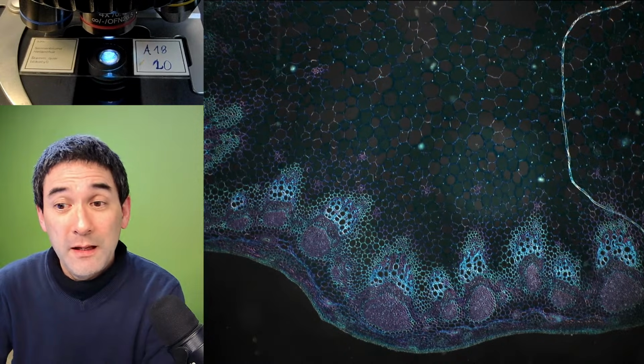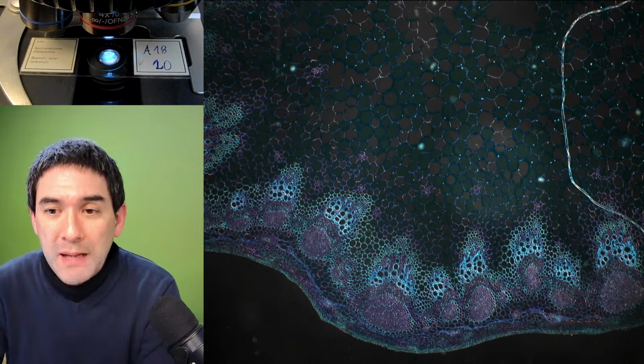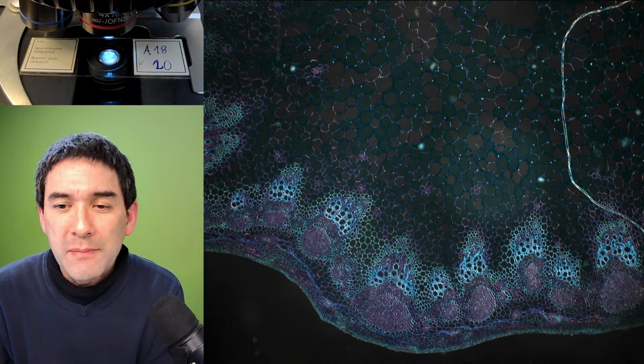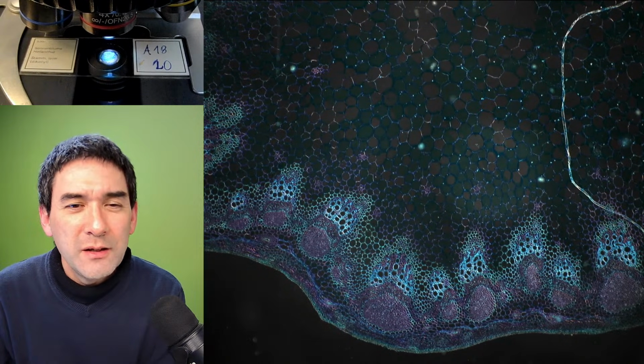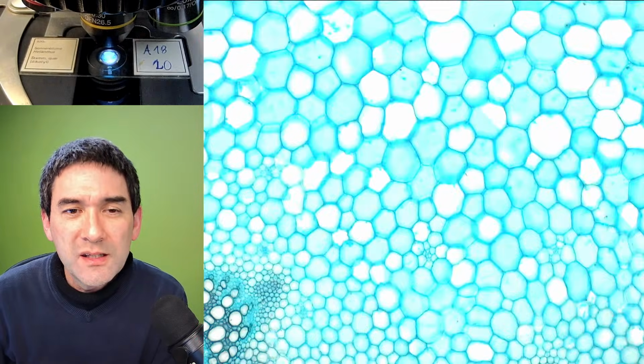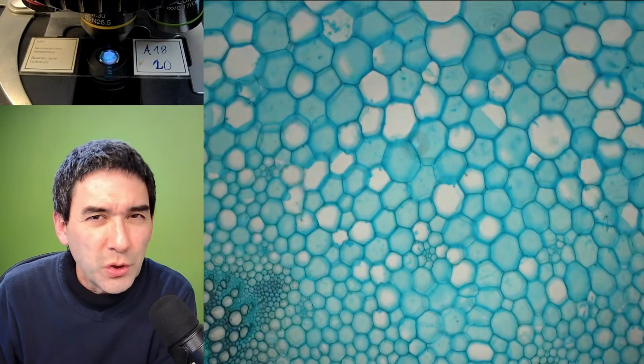If you have any green, yellow, or red paper wrapped ones, please quarantine them and handle with gloves. The pigments may contain arsenic. I would like to have a little more info on that. Does this mean that they actually used arsenic to make the red color? Or did they use arsenic to preserve the paper?